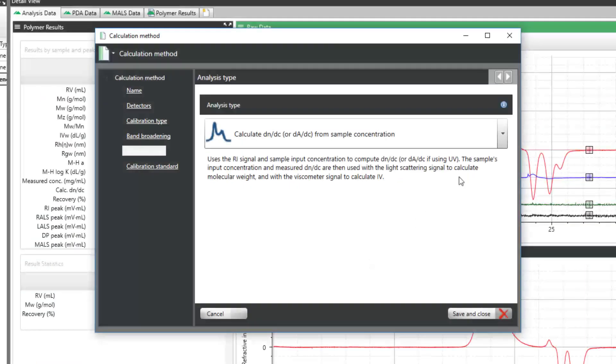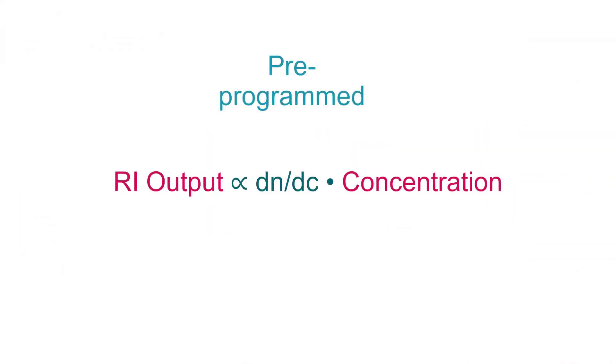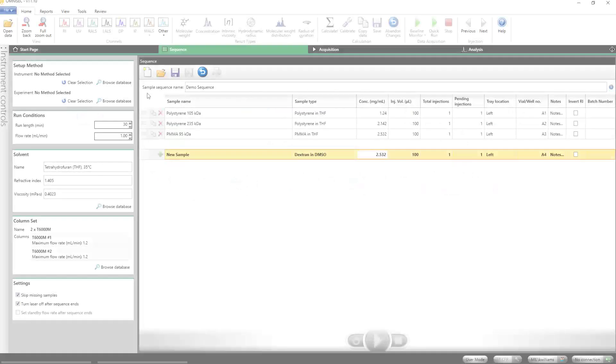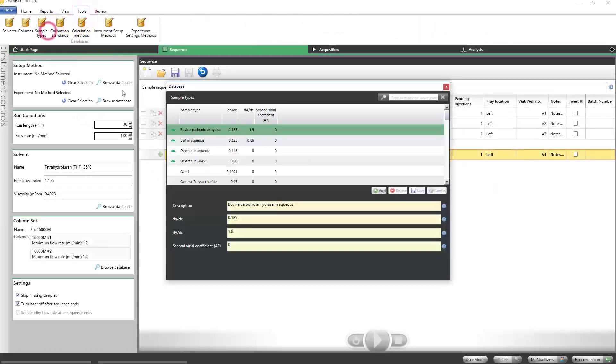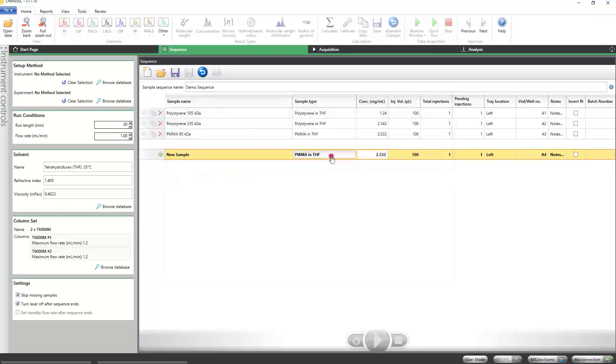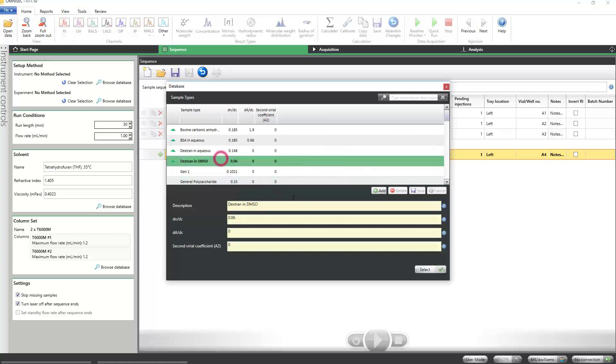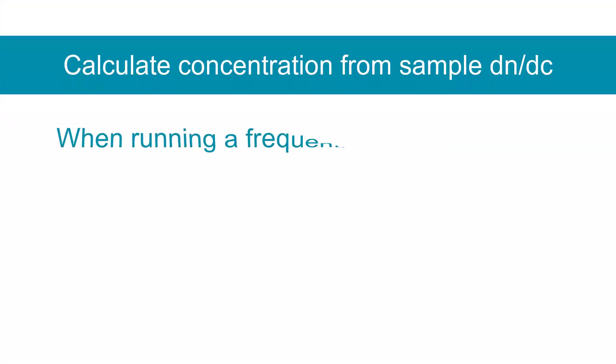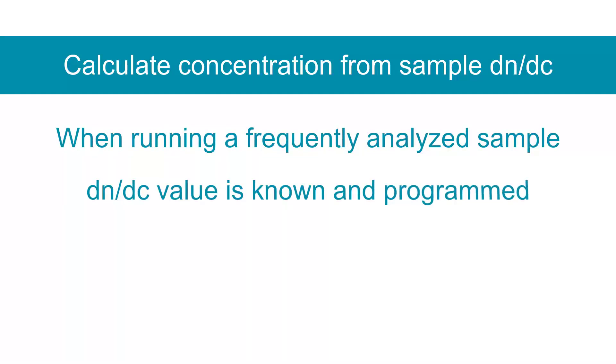The second, Calculate Concentration from Sample DNDC, uses a pre-programmed DNDC value along with the observed refractive index response to determine the concentration of the sample. The sample DNDC is set in the sample type database and then assigned to the sample in the sequence. This method works well when running a frequently analyzed sample type in which the DNDC value is known and has been programmed.